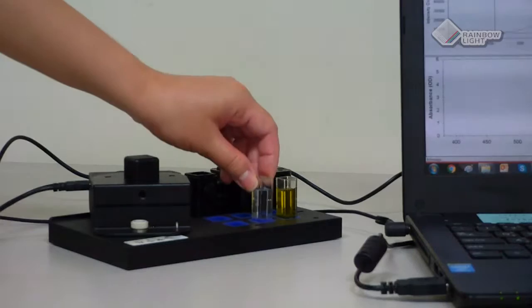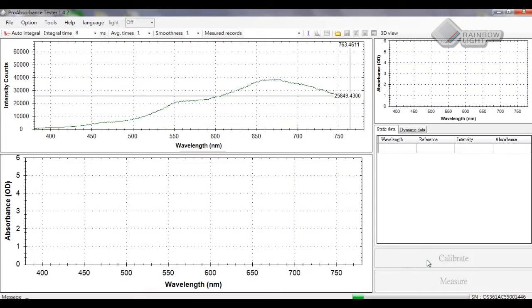We are going to measure the water first. So please put the water inside and click calibrate.